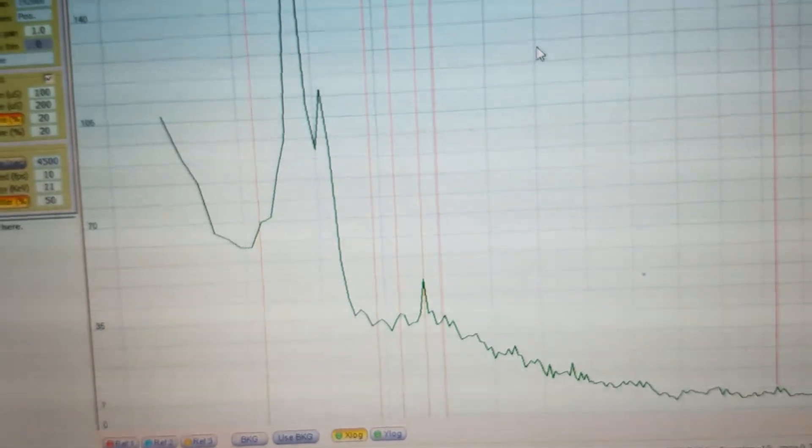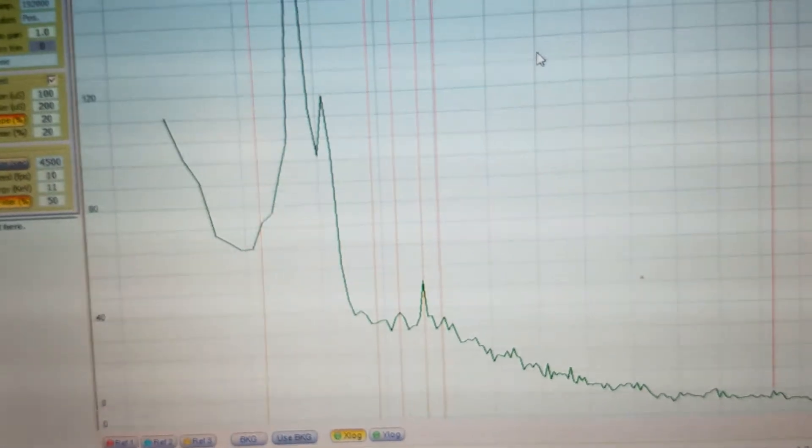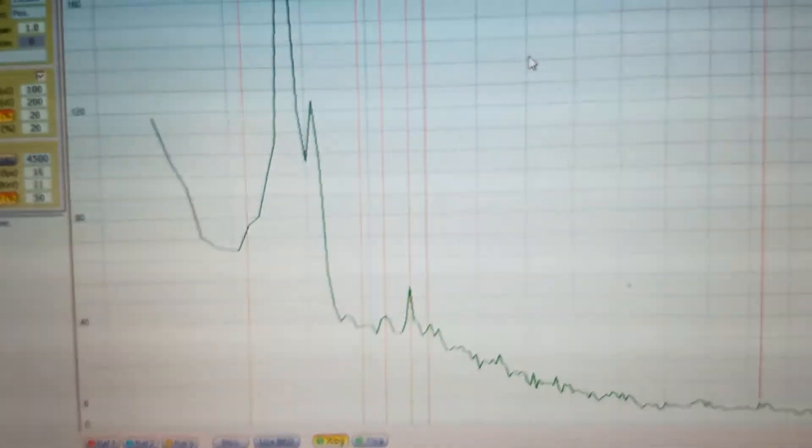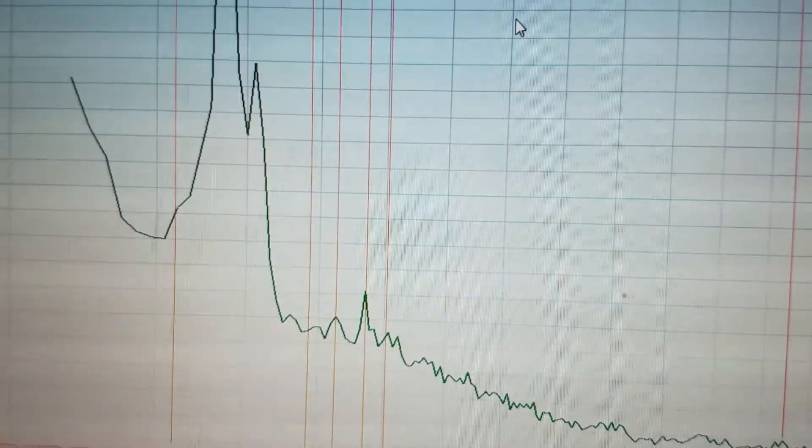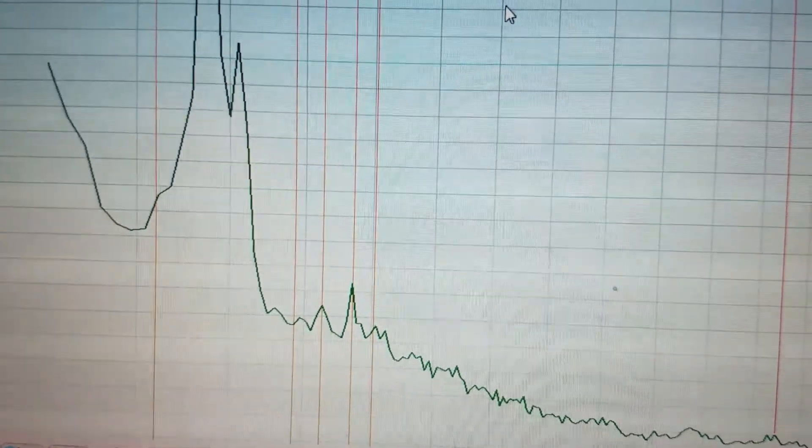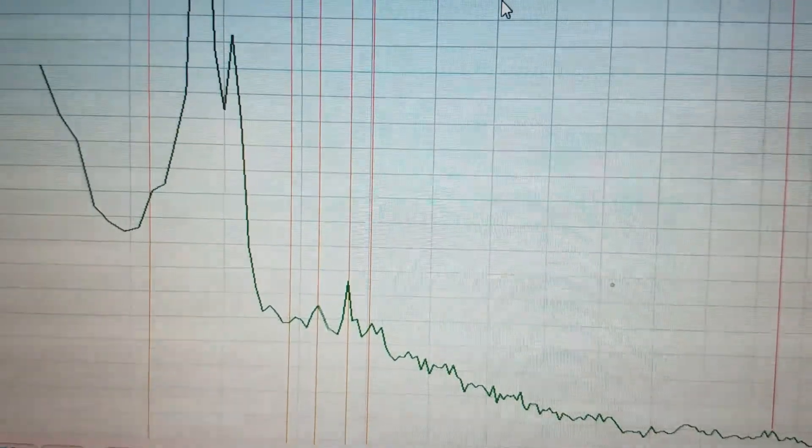The other three peaks are barely coming above the noise at all. And the main peak is not nearly as active.